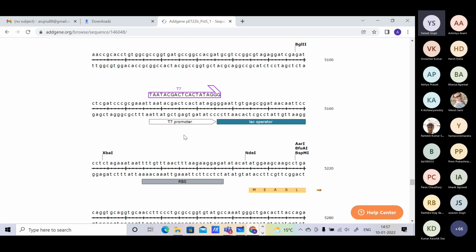Yes. All clear. Okay, so when somebody asks you to write down the sequence of the RBS, you click here and highlight it. Now, if you start with AAT and end up after T, it's absolutely fine, because you are highlighting the region of interest, that is the RBS, the ribosomal binding site.